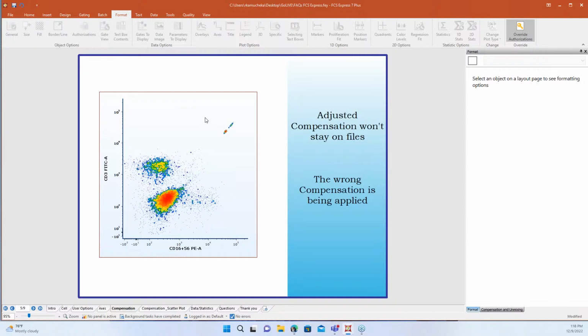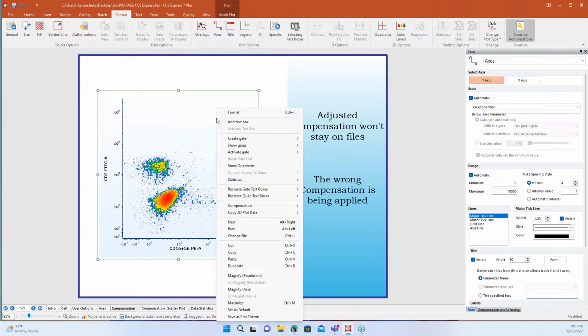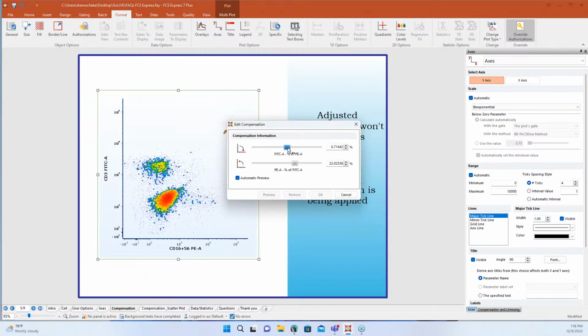So what can happen in this instance, I am using the data file for my compensation here. So when I look at this plot, it's going to be using the compensation from the sample itself. So this is donor tube 2, and that's the compensation that it's using. Now, if I needed to make some adjustments here, I can do that, grab my compensation here, adjust these, right? We'll do something wonky just so you can see it. This is not the best approach, right? We want to have great controls so that we don't modify our compensation, but if you need to just make a small minor adjustment, you can do that. And we'll click OK here.